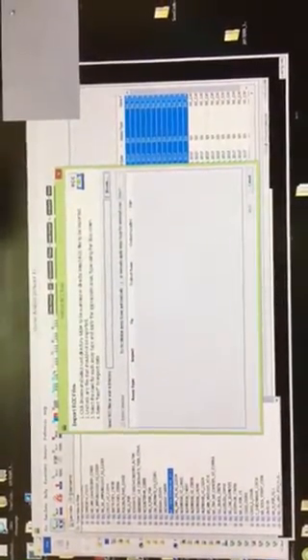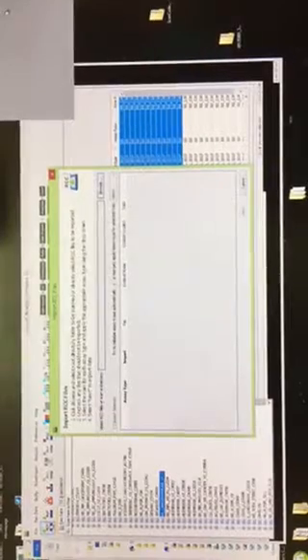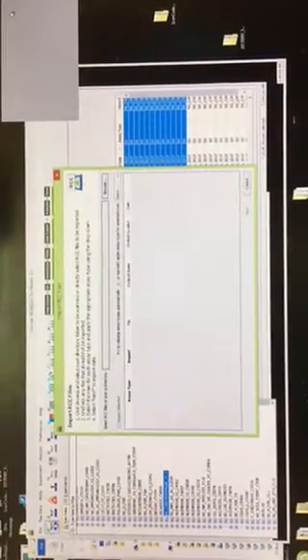So wait a second. Can I interrupt? Oh no, it's okay. You can interrupt. I just asked you to repeat that because I didn't quite hear the question. So when you get the RCC file from the machine, is the RLF file already associated, or do you have to import twice?